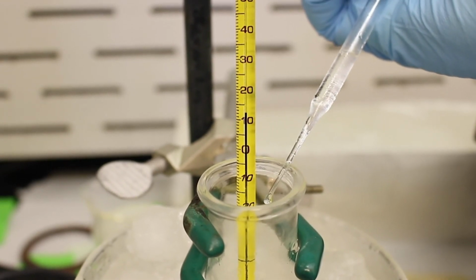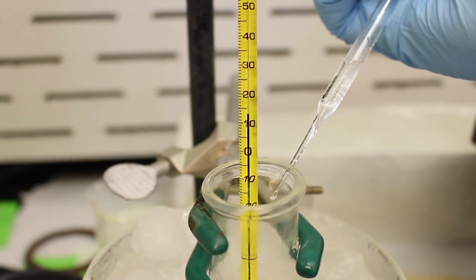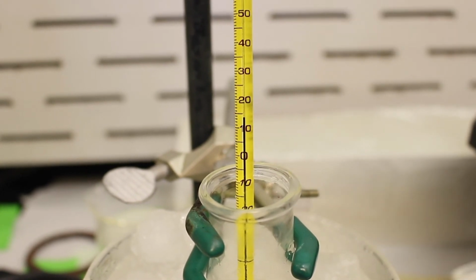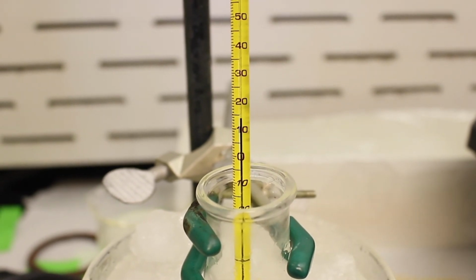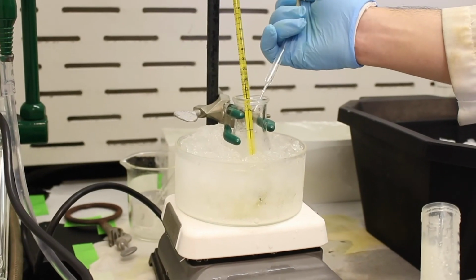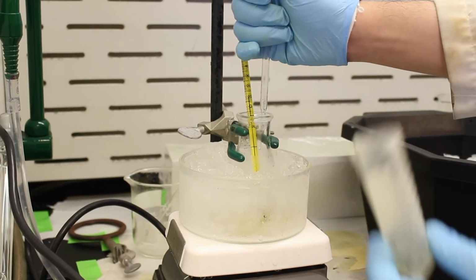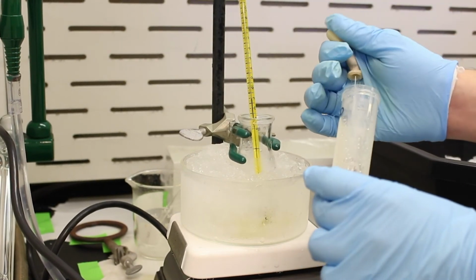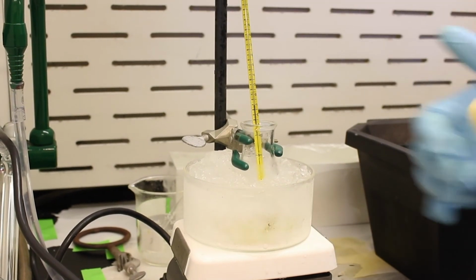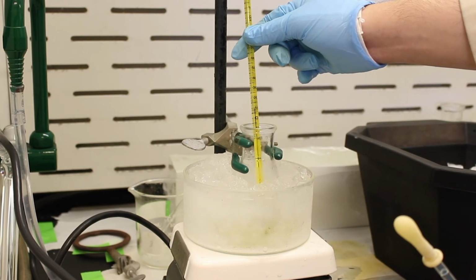You can see how quickly the temperature increases as I add the nitration mixture. So gotta be careful not to overshoot. Okay, so I believe we've added all of our nitration mixture. And for the most part, we have been able to keep it under 15 C. Right now it's at about 10 or 11.